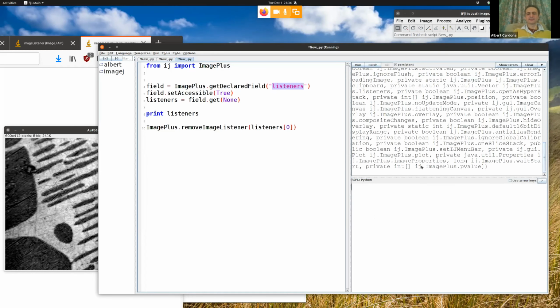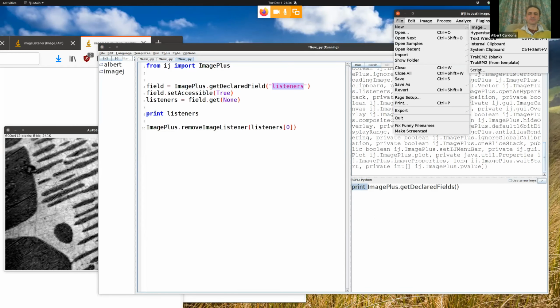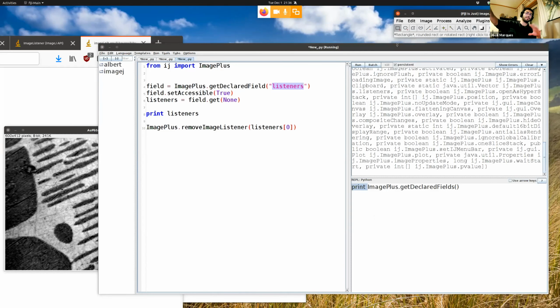And this gives me a list of 10 bazillion fields, right? So now I can do for field in. How do you get that IDE for Python in the macro Fiji? I don't have that. You mean like this? Yeah. File new script? No, not the file new script. I have the script editor, and then I have the output window, but I don't have that interactive.